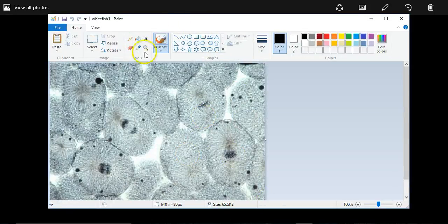Now then, I'll just go in here and I'm going to label a few of these. So right there. And then let's see, I want to label that one, and that one looks like I can't put it out here at the end.